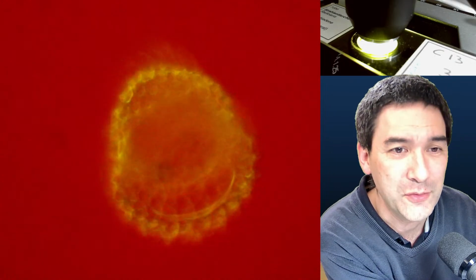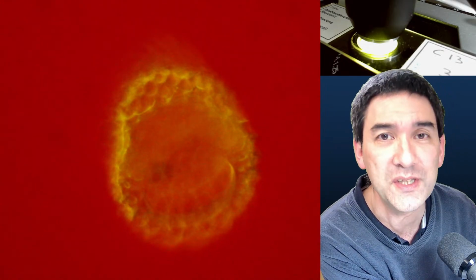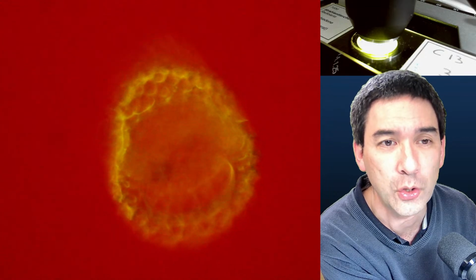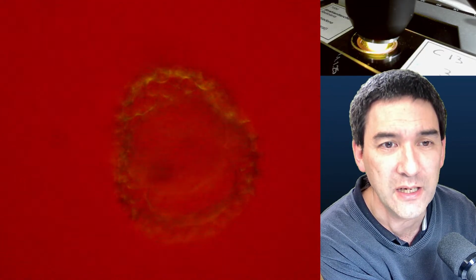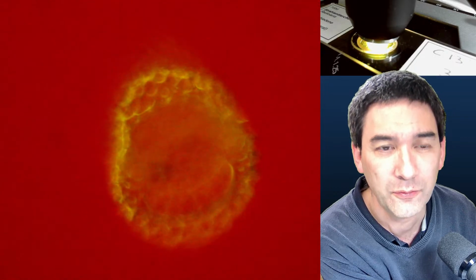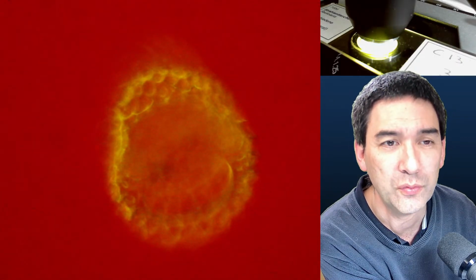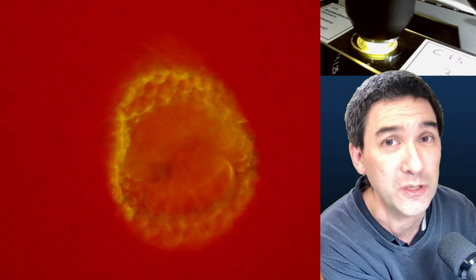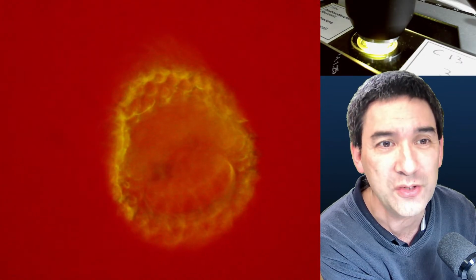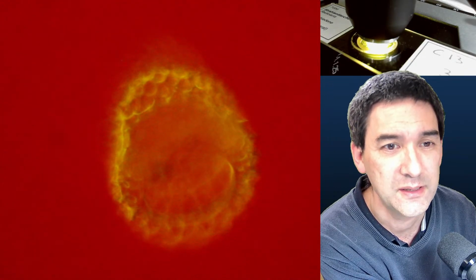But through the microscope, it's actually way better. So now what happens if you don't see anything? You have to open the condenser all the way. If you close the condenser diaphragm, look what happens. Of course, you're taking away the light. This is also maybe one of the reasons why it might appear to be a little bit low in contrast and especially low in depth of field, because the condenser has to be open all the time.